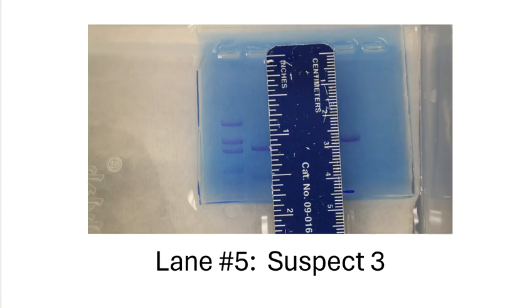Finally, in our last lane, this is suspect number 3. In suspect number 3, I did have a little mystery peak that happened down here at the bottom that did not show up very well at all. But just as always, here is the well. That's where we started the sample, and then the sample migrated down. So this is where one of the base fragments stopped, and right here is where the other base fragment stopped. So I will let you record those distances as well, because once more, just like the rest, you need those distances in order to do some of the laboratory work.